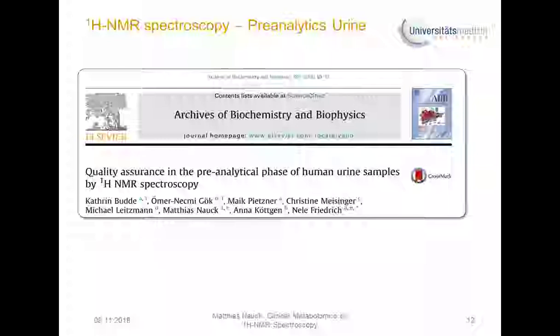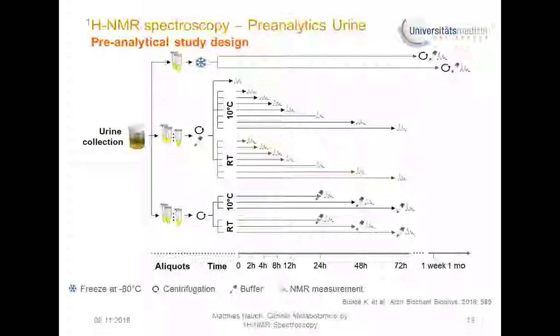When we are applying biological samples, we learn from our clinical chemistry and laboratory medicine knowledge that pre-analytic plays a very important role, and that we observe in many situations changes of our analytes according to not sufficient or not adequate sample preparation. And therefore, we look carefully at these aspects of the pre-analytical approach.